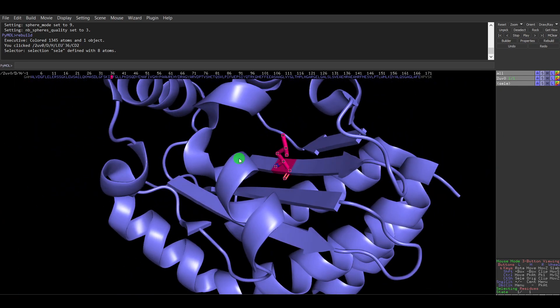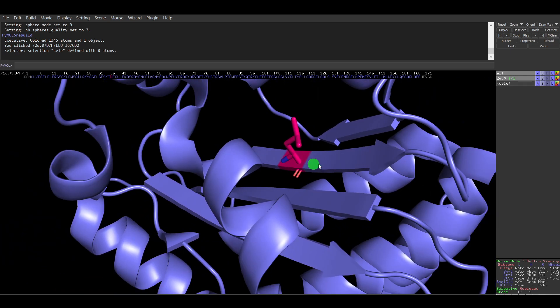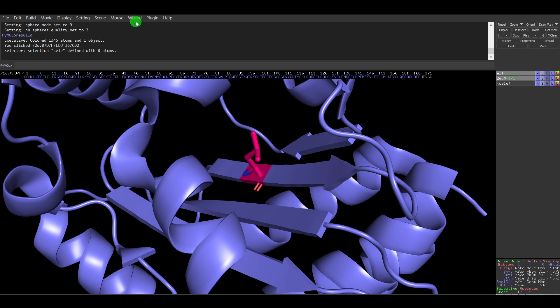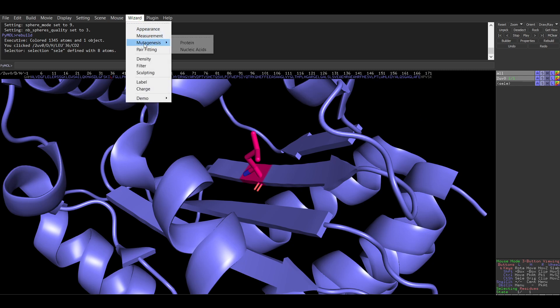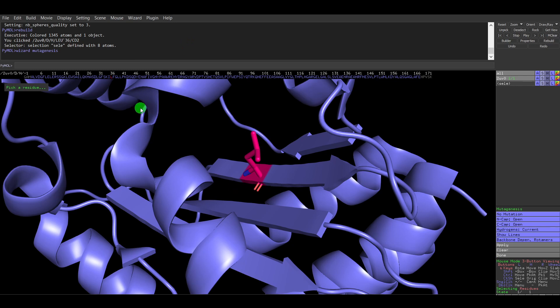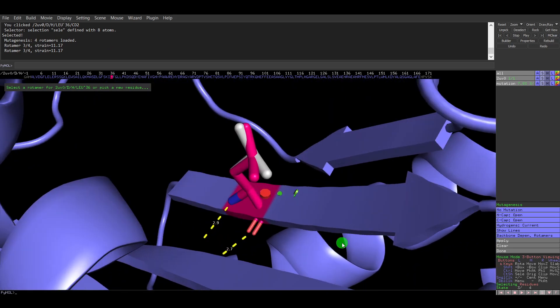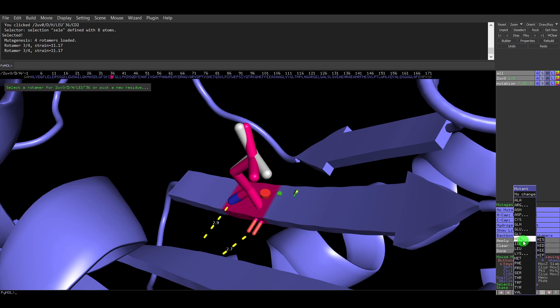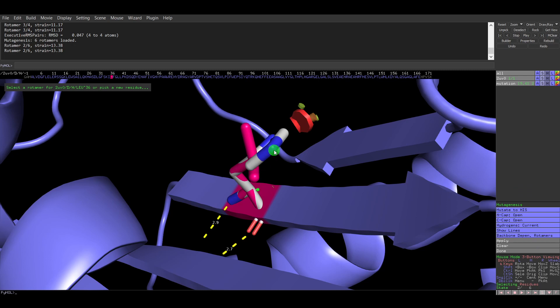Now I want to change this residue with another amino acid. To do that, go to the Wizard menu at the top, select the third option which is Mutagenesis, then click Protein since we are changing an amino acid in the protein. The mutagenesis tab opens with 'No Mutation' shown. When I click on the amino acid, I can select a replacement — for example, I want to change this lysine to histidine. The lysine is still shown because I haven't clicked Apply yet.